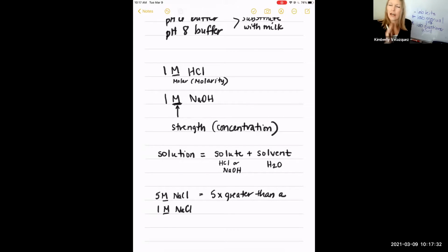Normally we learn how to calculate that strength. We're not doing that this semester because people want to come at me with flame and pitchforks when I do that. It's not something people enjoy. So at some point you'll do it in a chemistry class, and that's good enough. Okay, so this is pretty concentrated. They're asking you to do a very specific dilution. You're starting with 1 molar, and you want to get it to 0.1 molar hydrochloric acid. That's 1/10 the concentration. But you want a specific volume also. You want 12 milliliters of it.